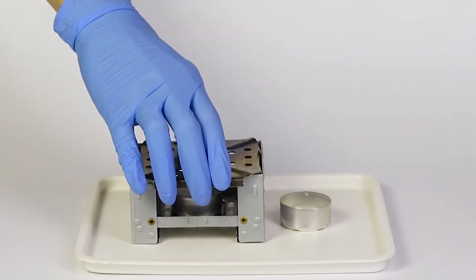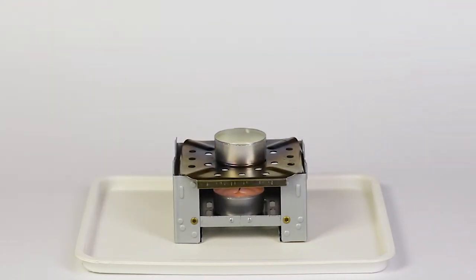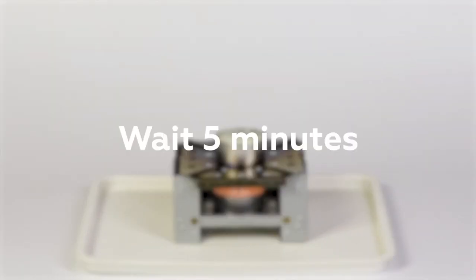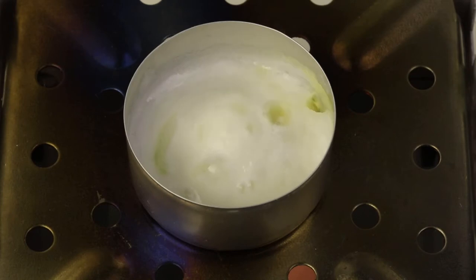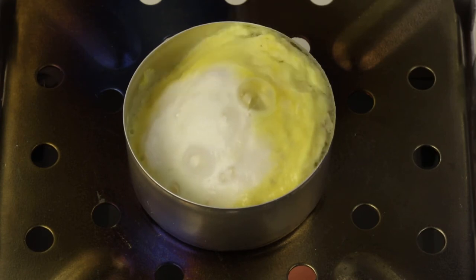Place the mold with the mixture onto the flame diffuser and wait for approximately 5 minutes. Calcium nitrate reacts with sodium hydrogen sulfate to produce nitric acid. When heated, the nitric acid reacts with the protein ovalbumin, which is contained in the egg white. As a result of this reaction, the protein coagulates, turns yellow, and starts to resemble the yolk.